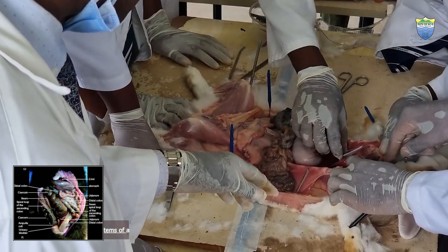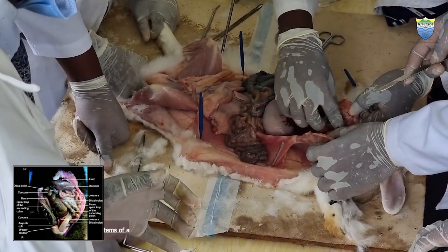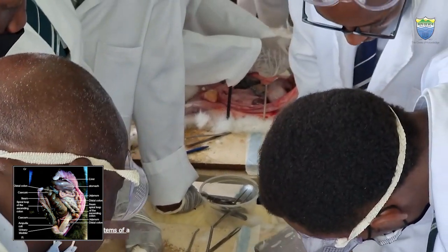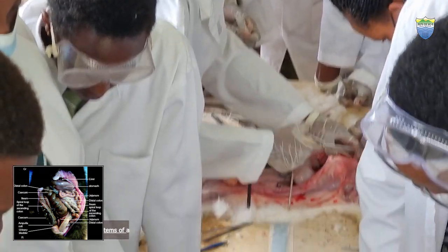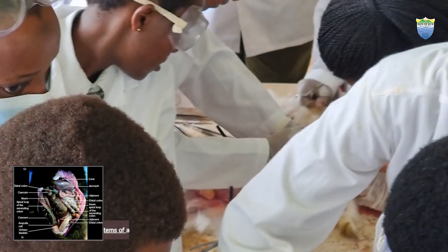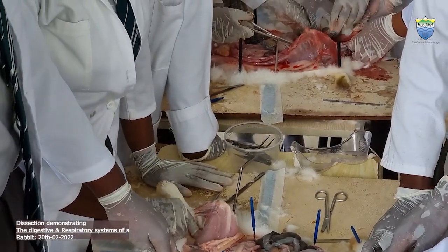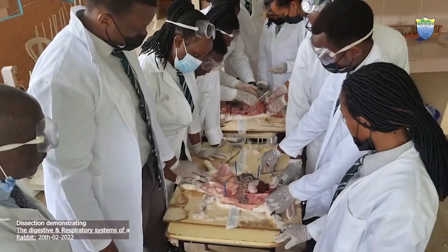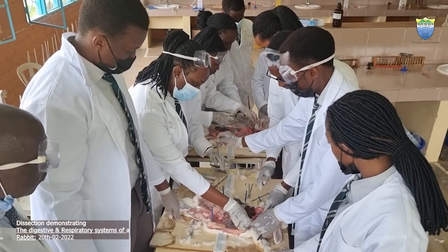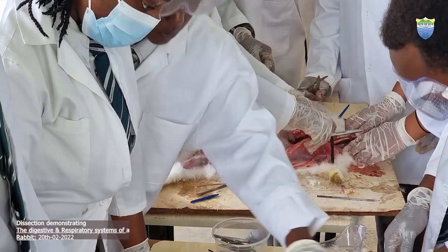The sides of the respiratory system are hard. Why do you think they are hard? To protect the internal organs. Which are the internal organs of the respiratory system? The heart and the lungs. Yes. Here up there is also a trachea. Trachea. Can you connect this, please? This is a compartment.